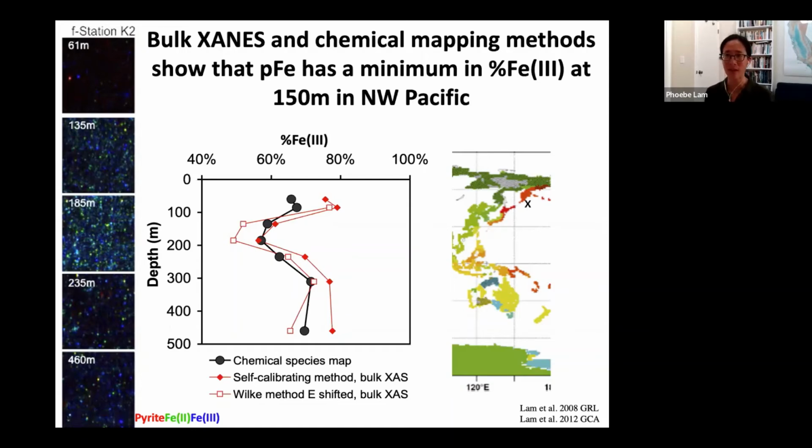And in my current life, we mix and match the two depending on what beam time we have available and what sample type we have. We will mix and match with some caveats. We spent a lot of time making sure that the answer we get from one technique is comparable to the answer we get from another technique, from another beamline, and from another synchrotron. This worked. This was data from SSRL.